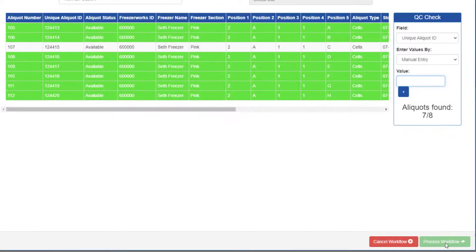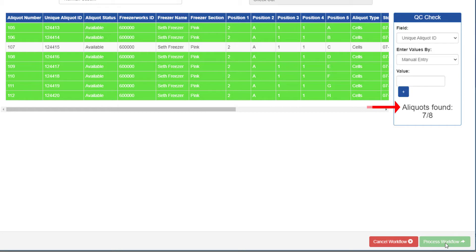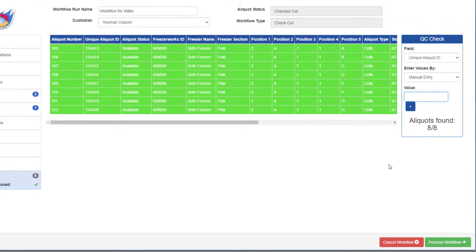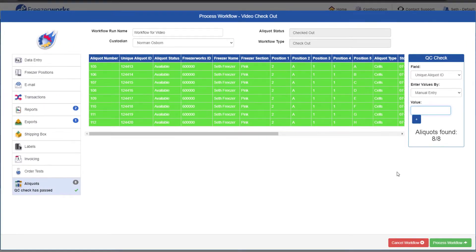If any values are missing, you can't process the workflow, so keep an eye on the aliquots found counter. You'll be able to tell which ones are missing because their records won't be highlighted in the list. Once the QC check passes, the red asterisk on the aliquots page will turn into a green checkmark, and we can finally process the workflow.